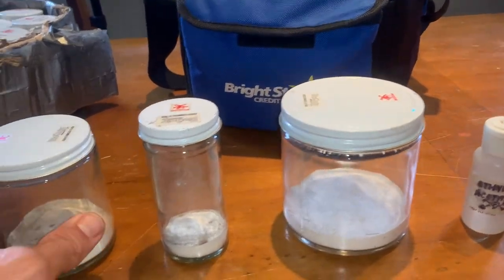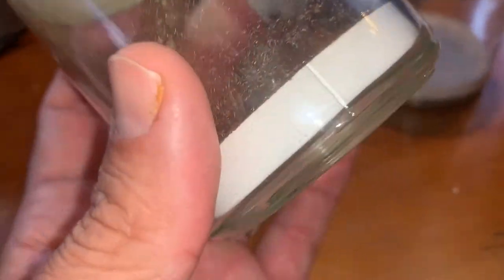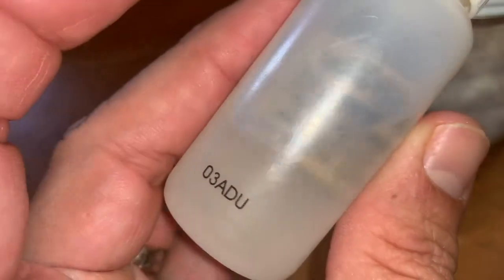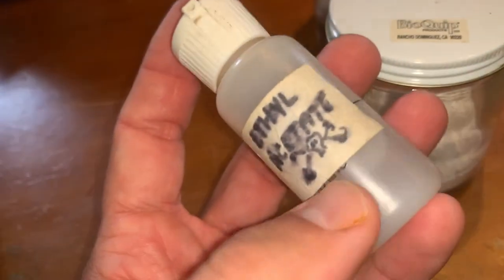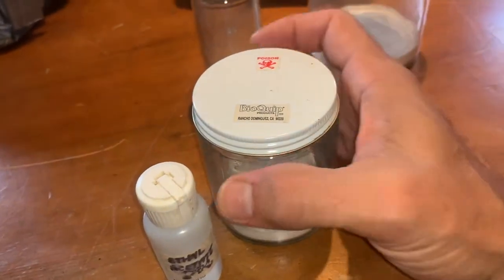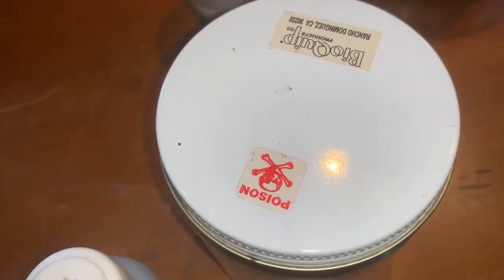Let's go through some basics of what a kill jar is. It's simply a glass jar with a plaster bottom — about a half inch thick — and that plaster bottom is what you put your killing agent into. In this case we use ethyl acetate. You can check the chem specs on that; it is toxic, you don't want to inhale it at close range. Kids, check with your parents before you touch any chemical, and make sure you're doing this in a well-ventilated area.